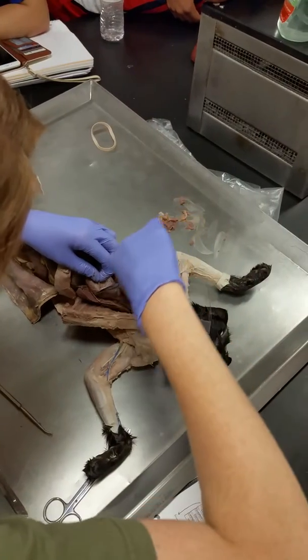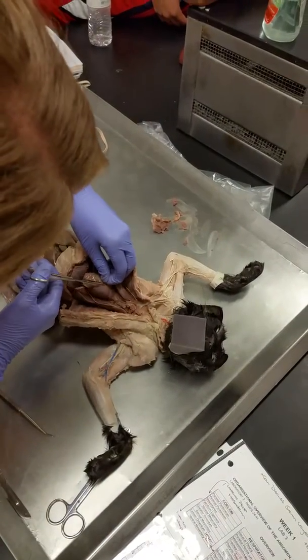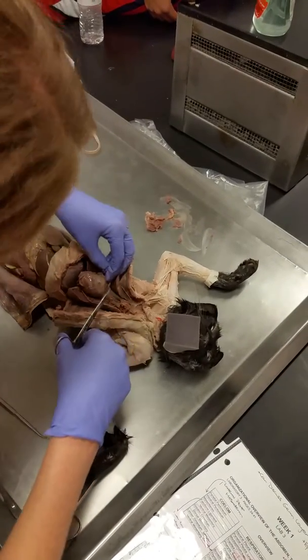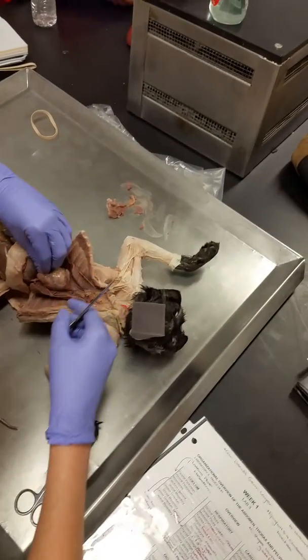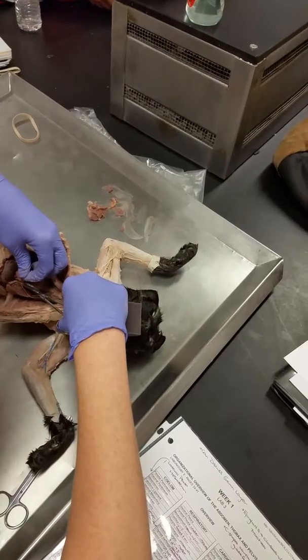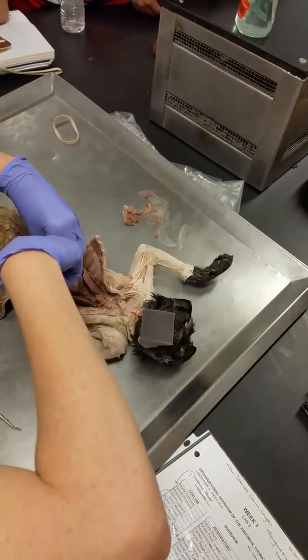And I'm going to peel it off of the heart, but I'm going to leave pieces of it attached so that we can look at it and go, oh look, that's pericardium. So I'm not going to completely remove it. I'm just going to cut it free so that I can actually look at the heart. Let's see here.